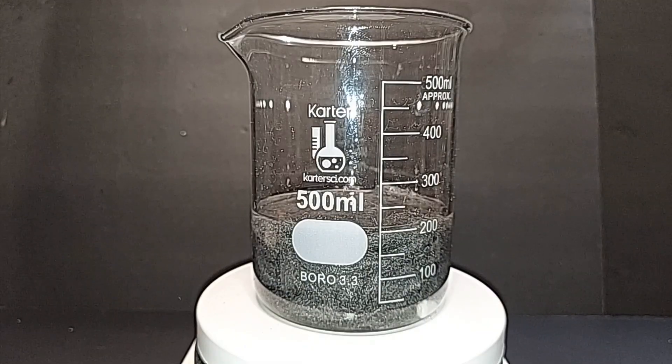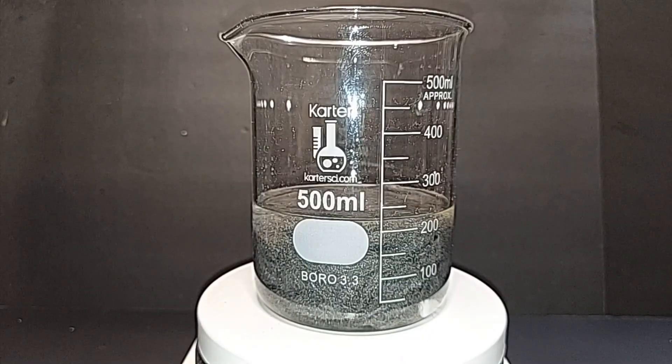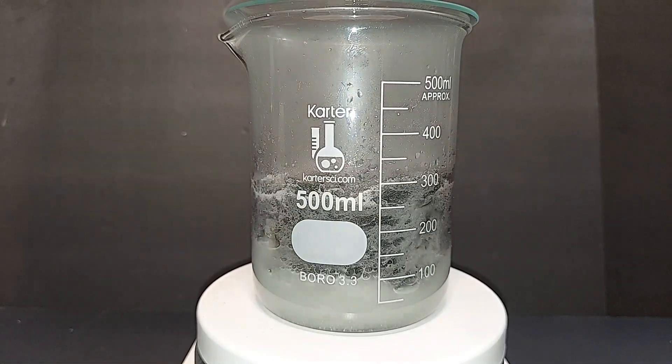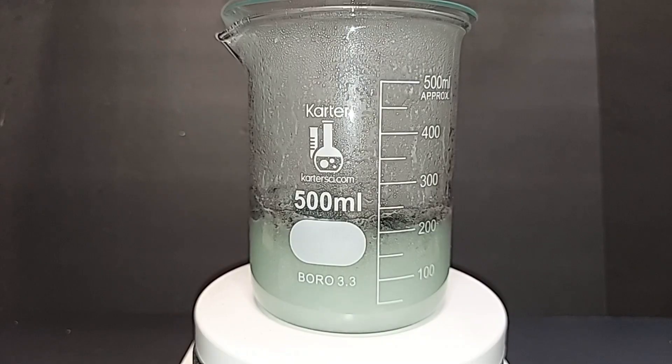Turning on the magnetic stirrer and ramping up the temperature. Placing a glass dish on top to hold in the fumes and liquid as much as possible. After about 20 minutes, almost three-quarters of the steel wool has dissolved — the heat really helps speed up dissolution. You can see a white stream of hydrogen being released from the spout of the beaker into the fume hood; the beaker is also full of it because it's been partially capped.